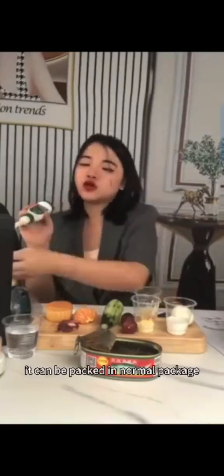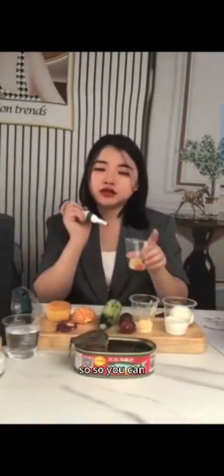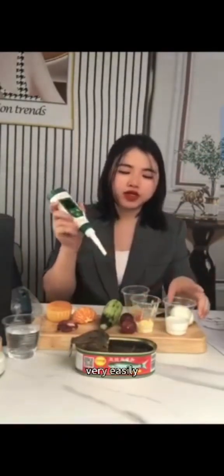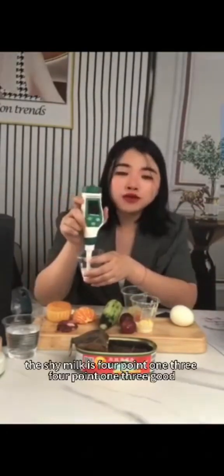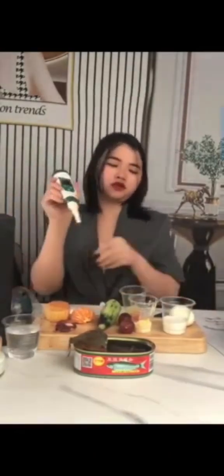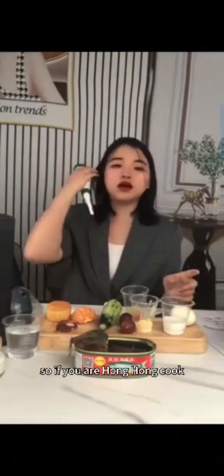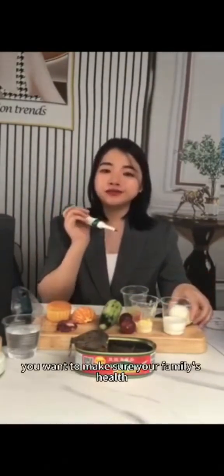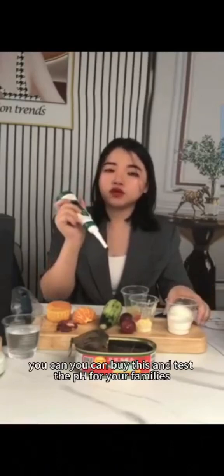Because jelly is highly acidic, it can be packed in normal packaging — it doesn't need to be in a sealed can. Now the soy milk is 4.13. You can see you can test water, milk, and drinking water with this meter. If you are a home cook and want to make sure your family's health, you can buy this and test the pH for your family.